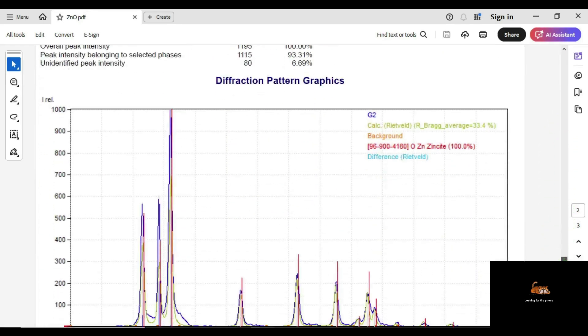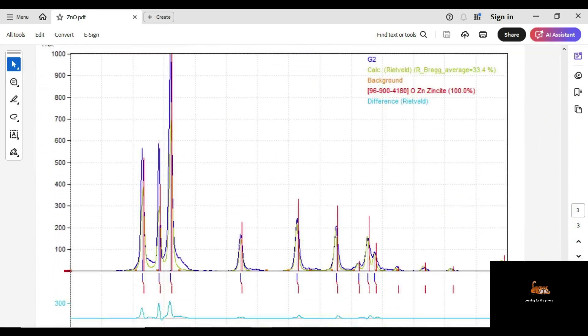Finally, this is nothing but the processed XRD graphic of my sample.